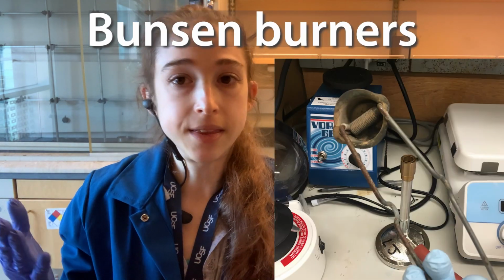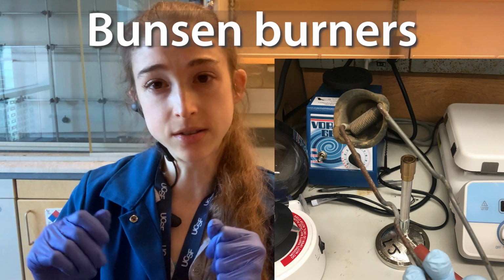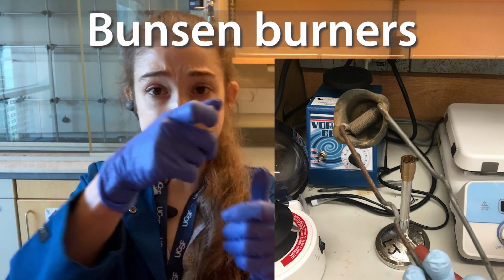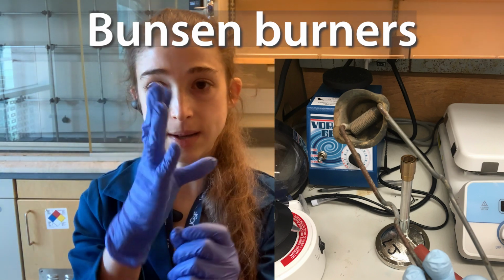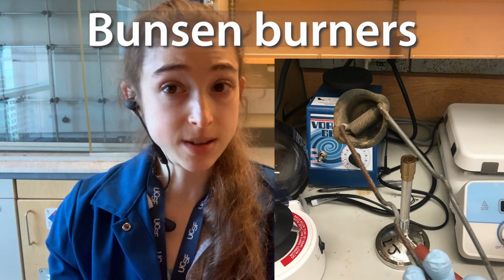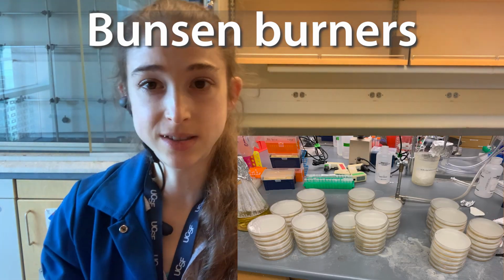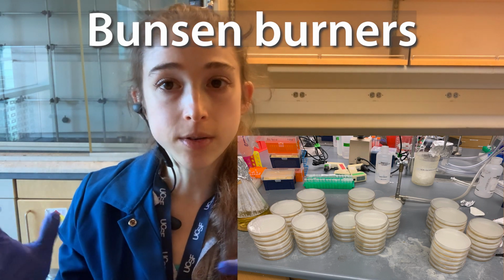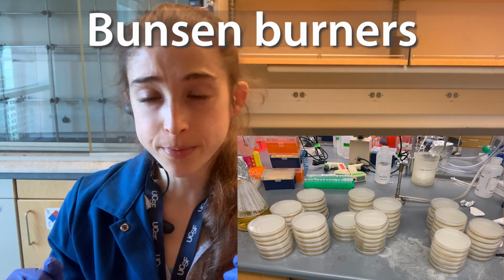My dad, I think he constantly thinks I work with Bunsen burners because that's what you see in all those stock scientist photos. I don't really use them that much, but basically you have a flint striker, and you go pew, and you turn on the gas line and then it makes flame. The most common thing I use them for is when I want to maintain a sterile environment, maybe when I'm pouring LB agar plates, so those petri dishes with bacteria food. Some people use them more, depending on your field, but sorry Dad, I don't really use them that much.